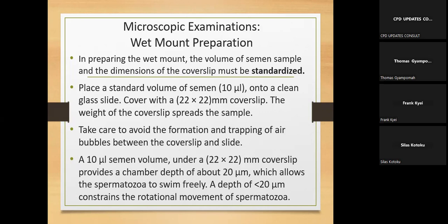So for histology, the mount is long. I'm not talking about the mountant, I'm talking about the section itself. Some sections are too long. They may cut a longitudinal section of something and it's long, and a 22 by 22 cover slip will just not fit it, because you are going to mount it under a cover slip anyway.